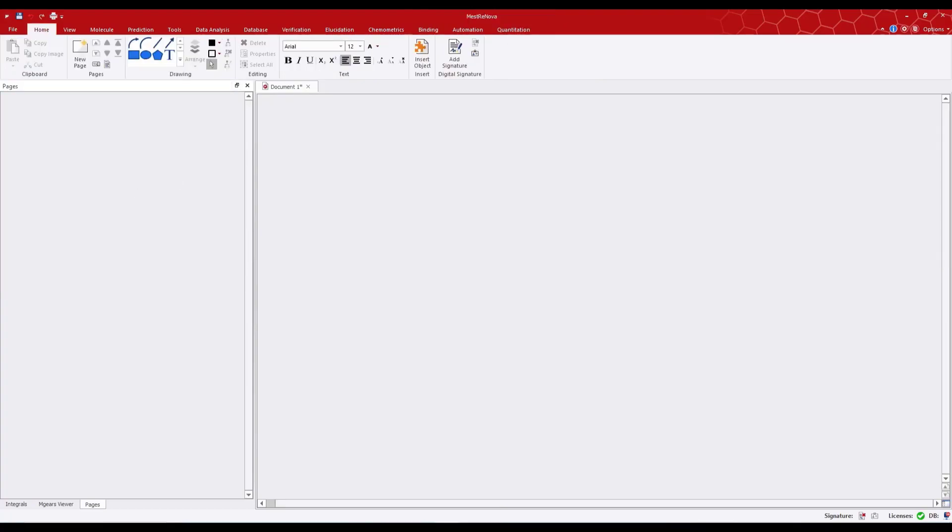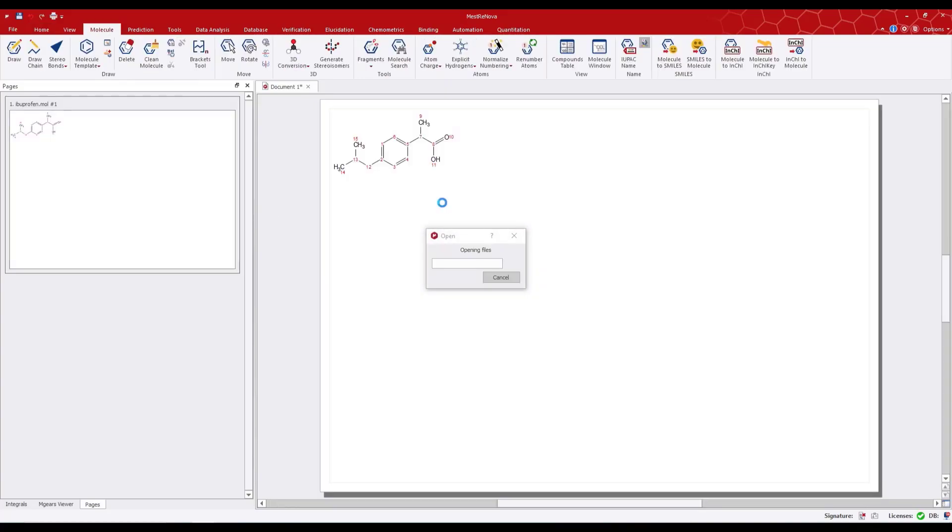We can also load multiple data sets by simply dragging and dropping a folder containing those data sets onto MNOVA.